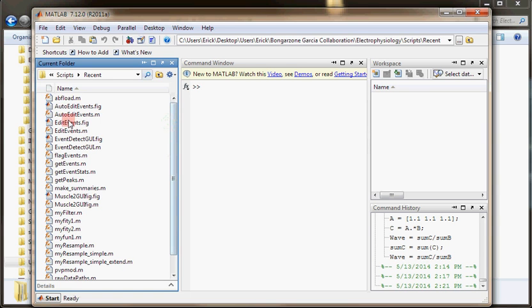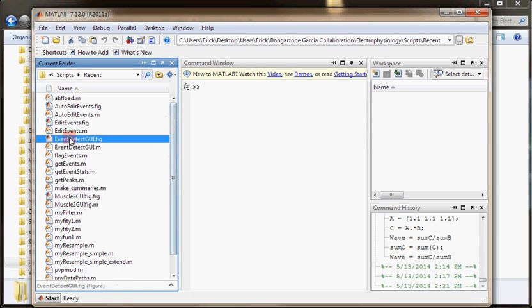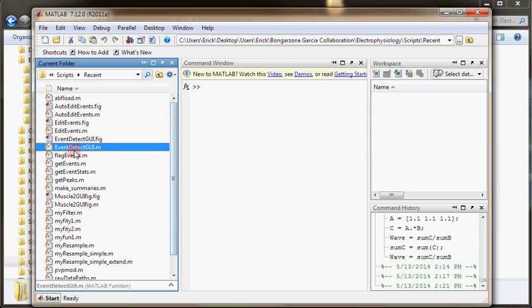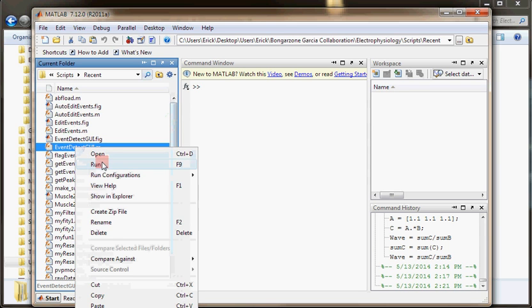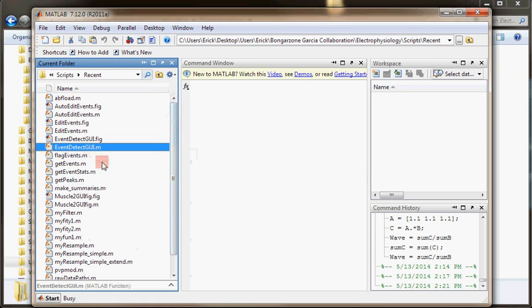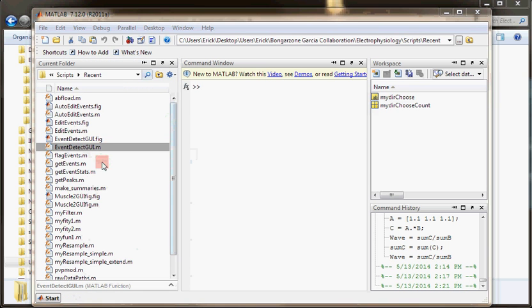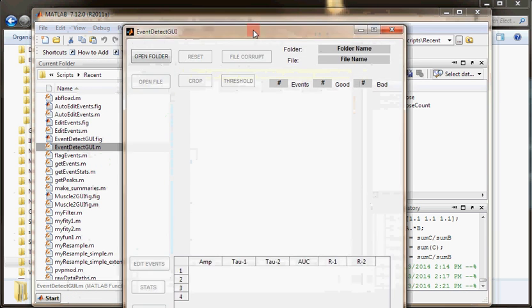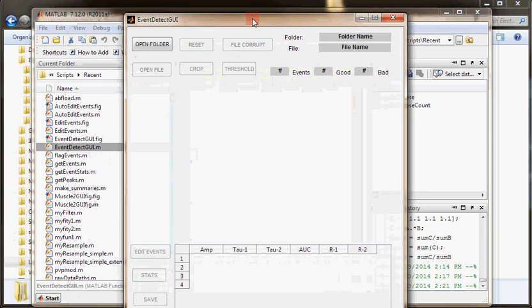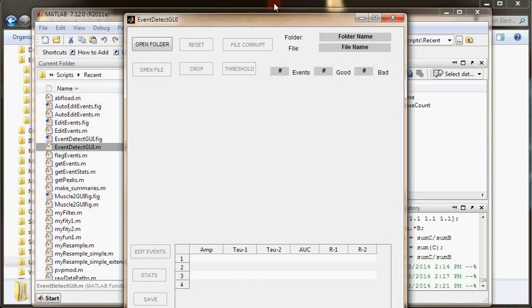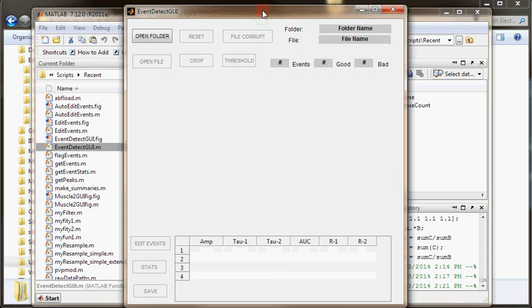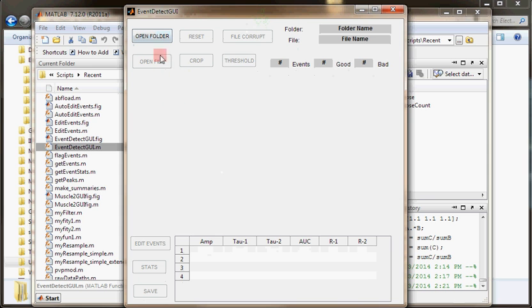Once I'm inside scripts, all I have to do is locate this file called event-detect-gui.m. I'm going to right-click and click run. And it'll start up a program, and you should get a window that looks like this. Essentially, this window is going to be our program we use to analyze the raw data files.